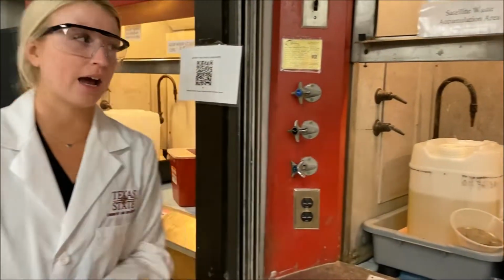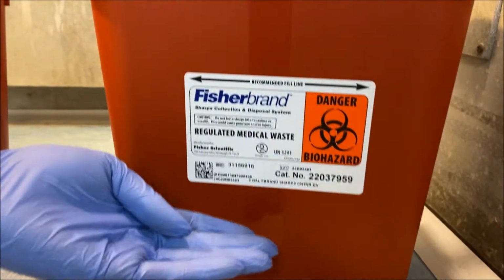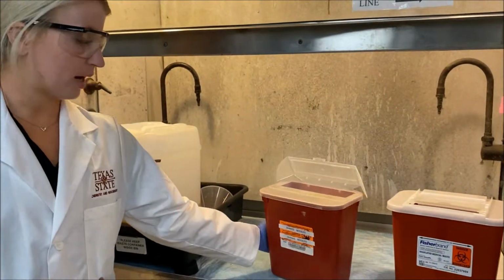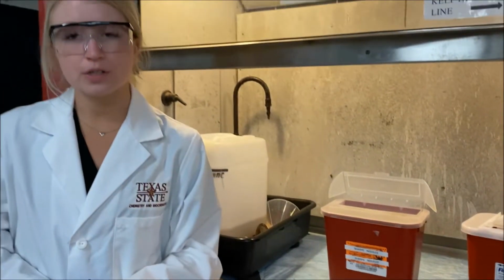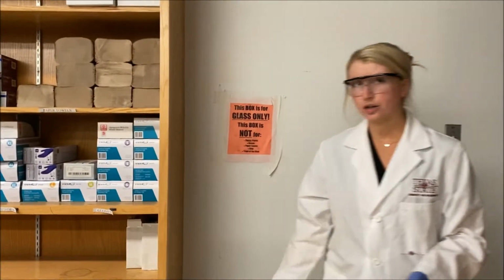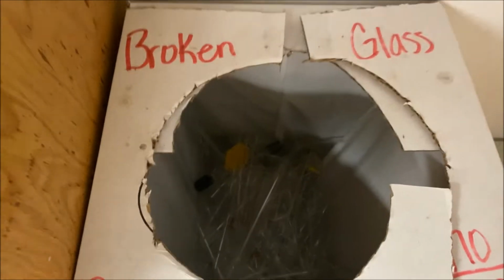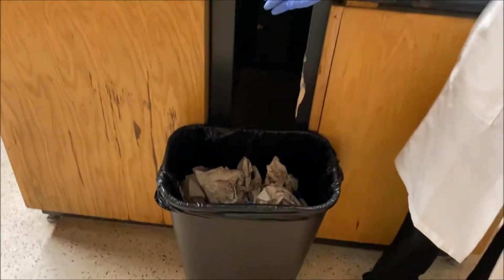And then some other waste we have can also be found in a fume hood. And this includes our biohazard waste container, and that's where all the biological hazards go, such as your blood. And then you have your sharps container, and you can see that it's labeled sharps, and you can see the inside of it has things such as syringes and sharp needles. And then you also have your broken glass container over here, and that's where you'll dispose of all glass, especially broken glass. And then lastly, we have our general waste containers, which can be seen here, aka trash cans.